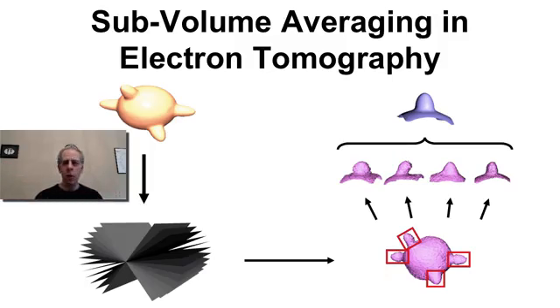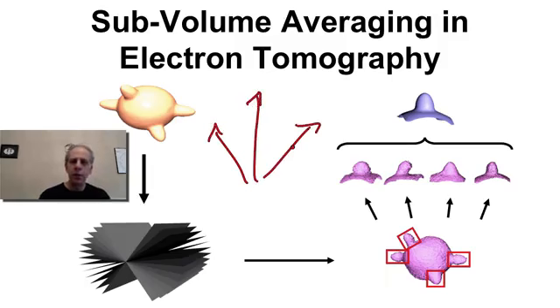but what's the challenge here? Multiple challenges. These images are very noisy. The spikes, the envelopes here, are rotated. We have to align them before we average them. Otherwise, it will be a mess, okay? If you average this with this, let's say these two vectors, you get something like this. Nothing to do with any of them. So you have to first align them, and I'm going to illustrate that in one of the next slides. And also, are they identical copies? Maybe there are multiple different structures, maybe slightly different, but still different. So we're going to have to rotate, align them, group only those that are the same, and only after we do all that, then we're allowed to average.